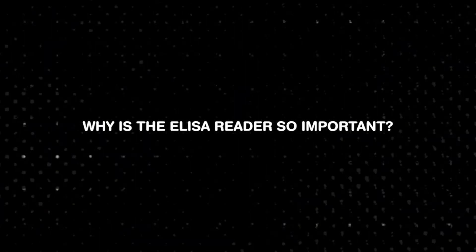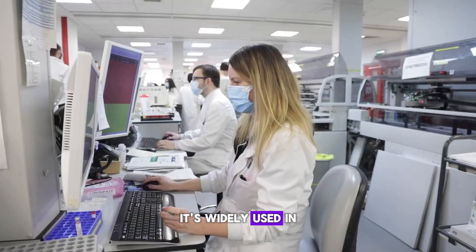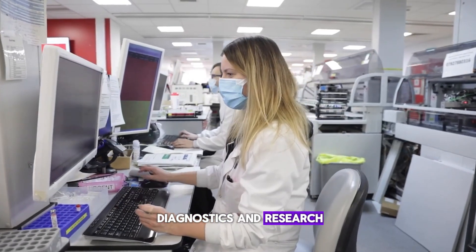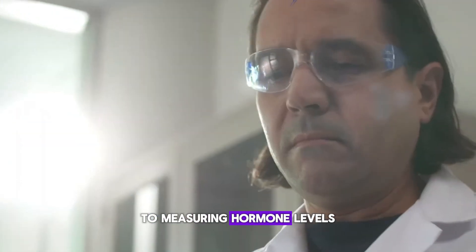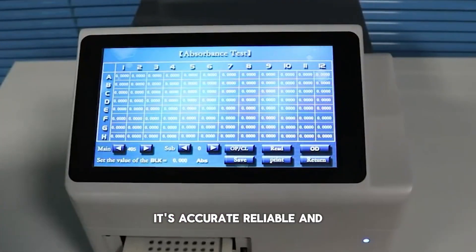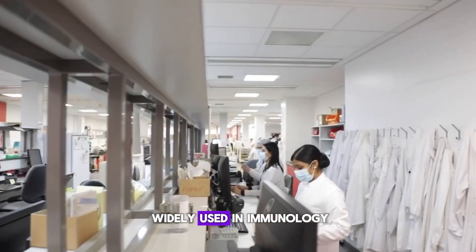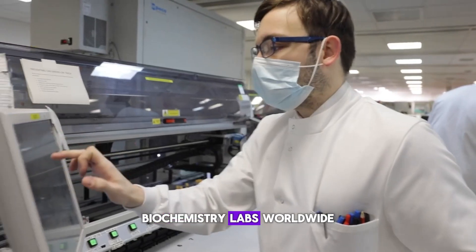Why is the ELISA reader so important? It's widely used in diagnostics and research — from detecting antibodies in infectious diseases to measuring hormone levels in blood samples. The ELISA reader plays a vital role. It's accurate, reliable, and widely used in immunology, microbiology, and biochemistry labs worldwide.